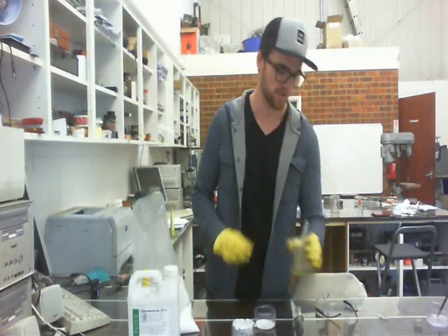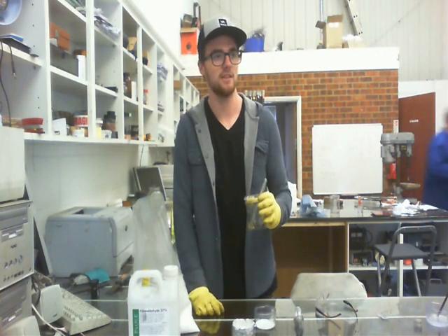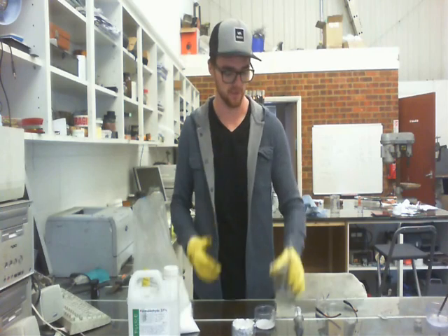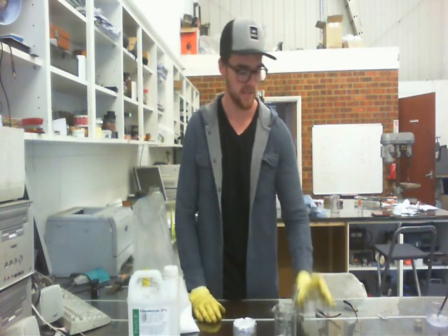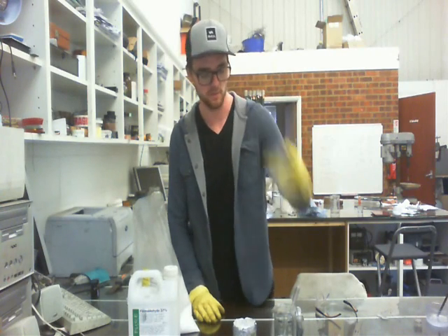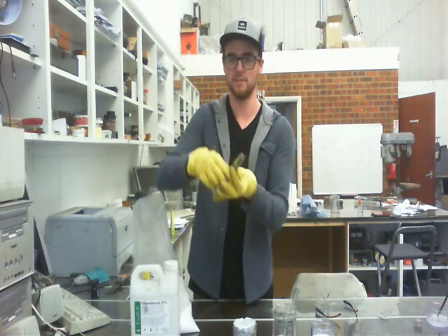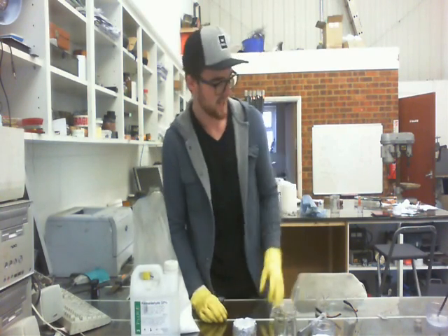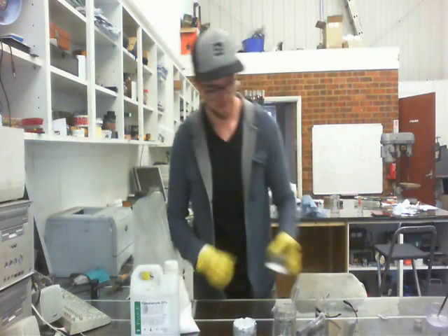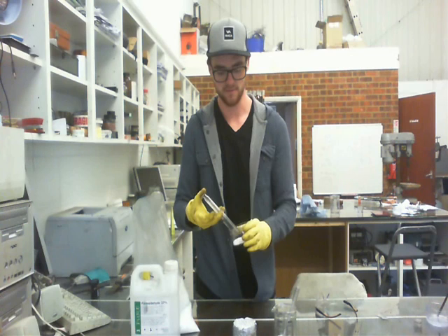All right, so for the third ingredient, we have sulfuric acid, and it's 96% concentrated. That's why these yellow gloves come in — very dangerous. The quantities we've got: 10 grams of the urea and 20 milliliters of the formaldehyde — very little, not dangerous, no big deal. So what we're going to do is put the 20 milliliters into the 10 grams of the urea.